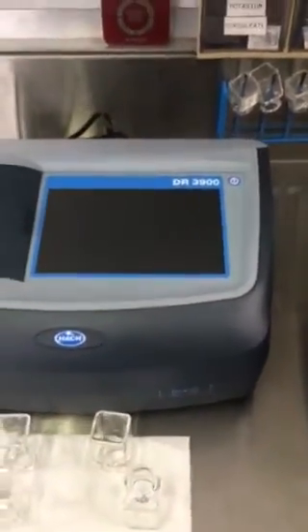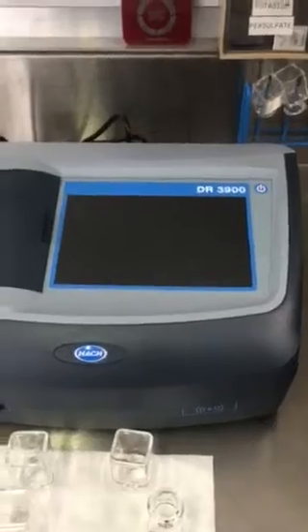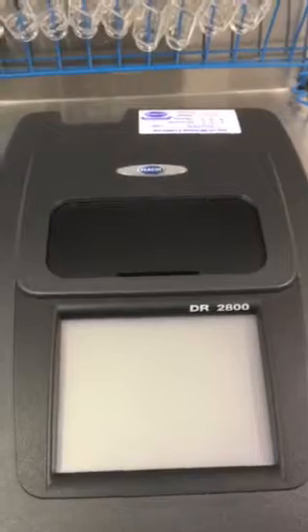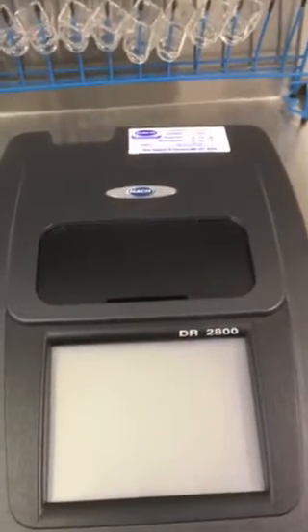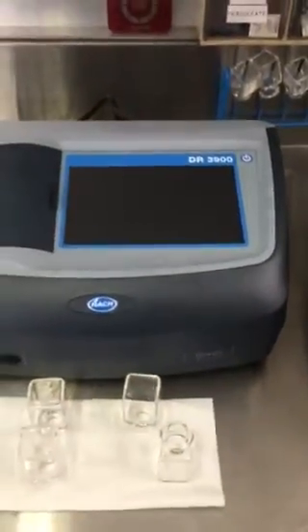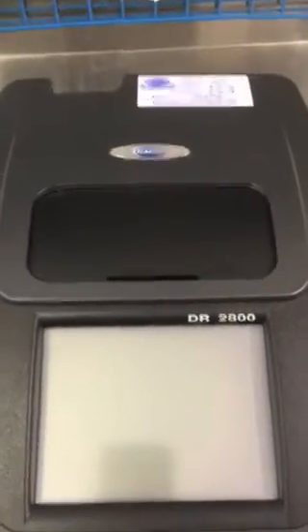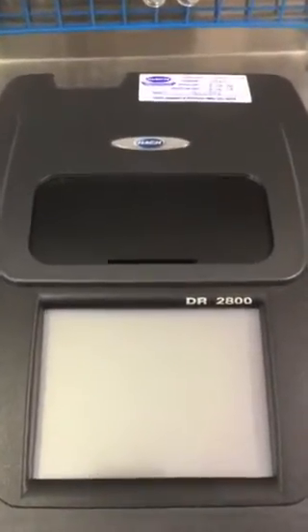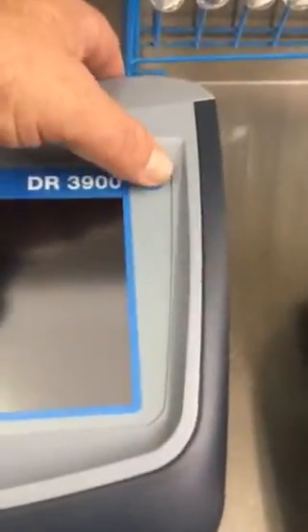Today we're going to be talking about our new spectrophotometer, the new DR 3900. We were using the DR 2800, but between our three labs we needed a new unit, so we got the 3900. The 2800 is going to go get a factory cleaning and will become our rotating spectrophotometer shared between the three labs.